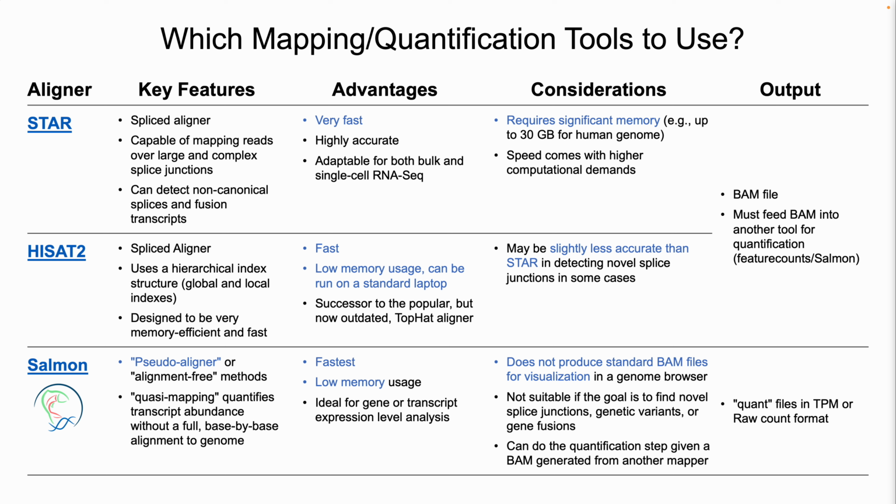They are true aligners, where it's taking the reads and then doing the process like BLAST, where it seeds and then extends to find out where in the genome does this map best, or where in the transcriptome does it map best. I put in blue the key things to consider when you're thinking about which one should I use for my data if you're doing this for a project or in the lab.